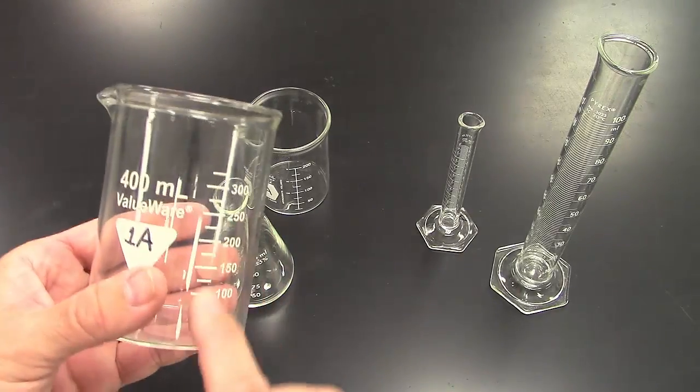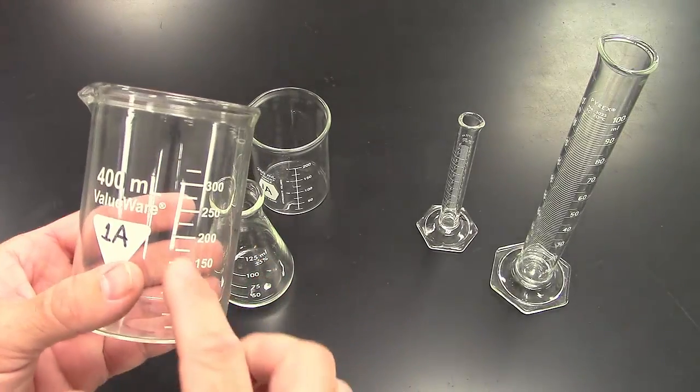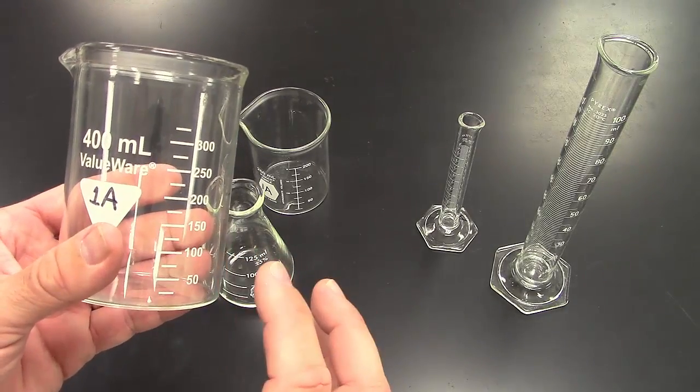See, these are meant for just making estimates. They're not really for measurements. Hey, if you need approximately 200 mils, you fill it up there. However, this glassware is not what we call calibrated to a precise level.